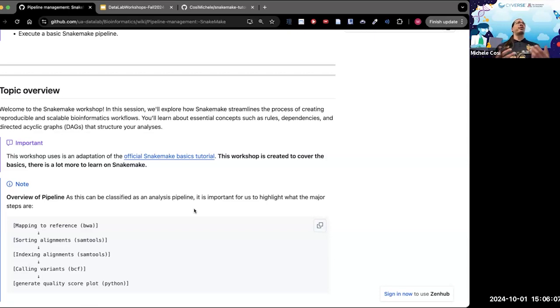Then you have all of these other tools from the past, the blast from the past, like Blast, like the BWA aligner, like SAMtools, which have been around forever, but you have to execute them through the command line.